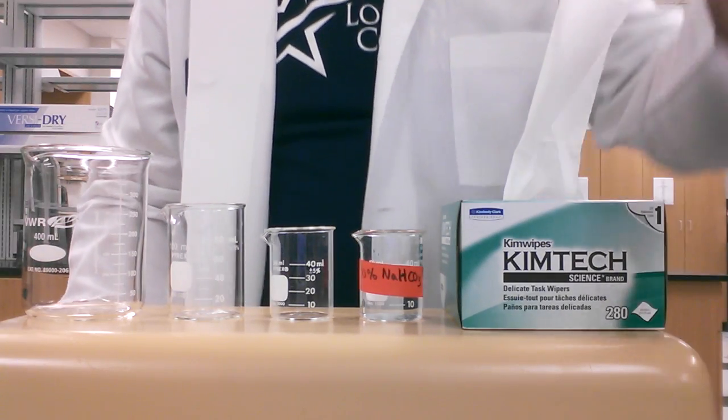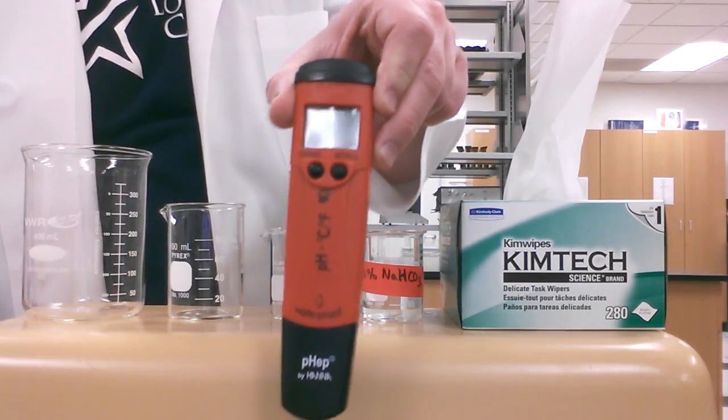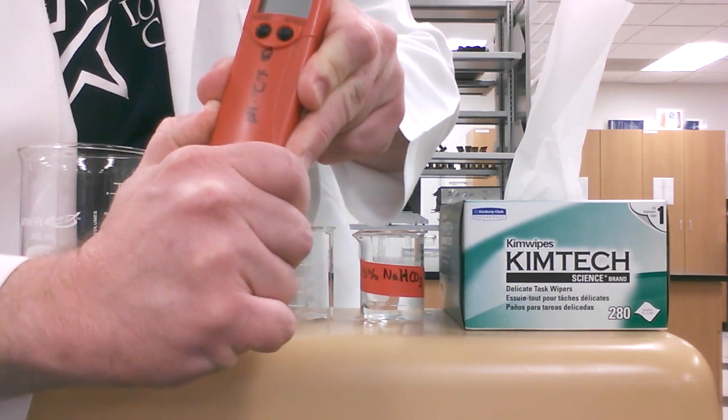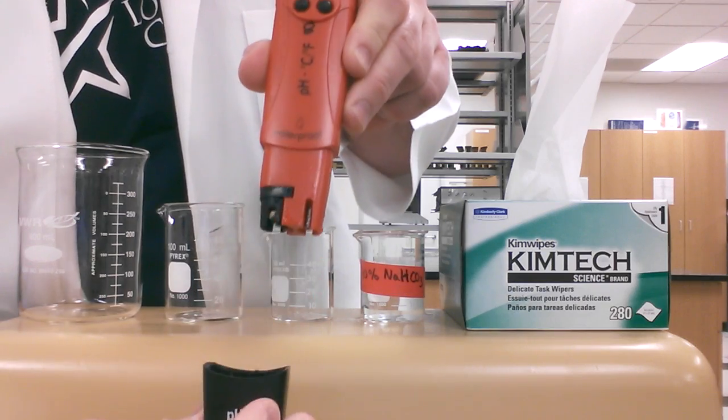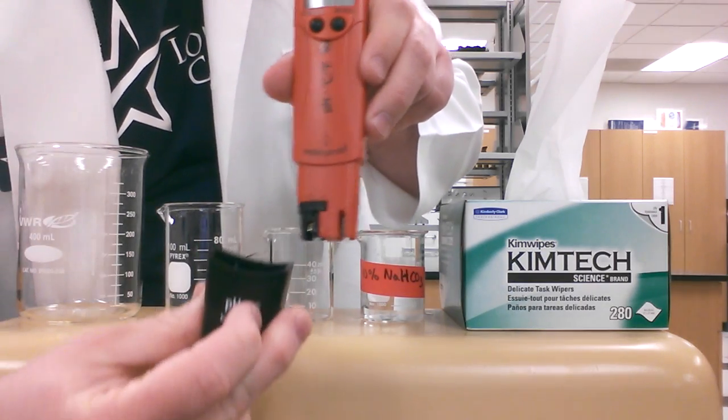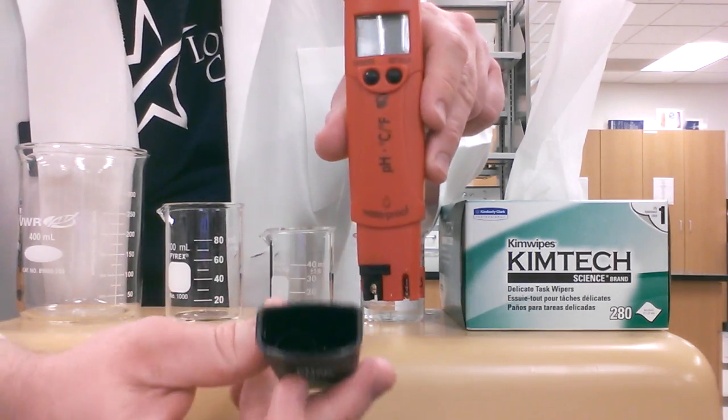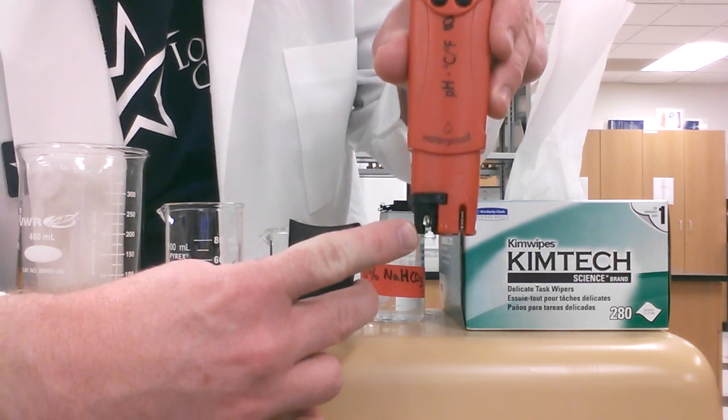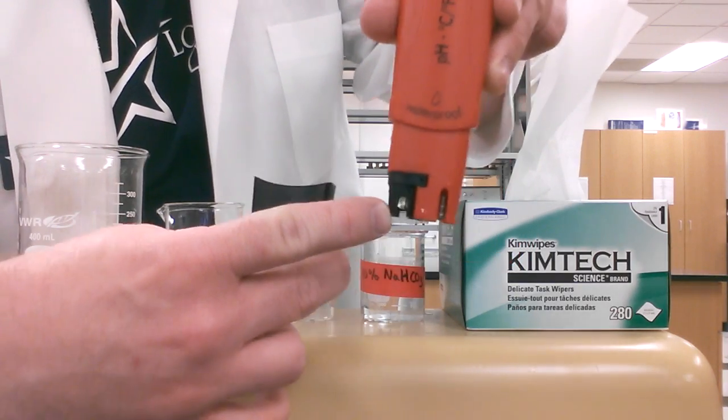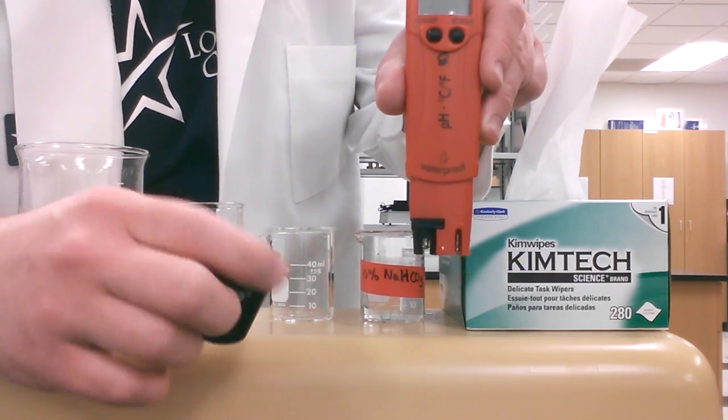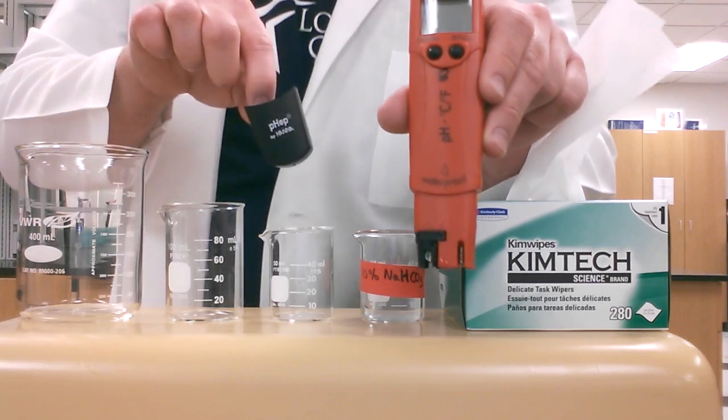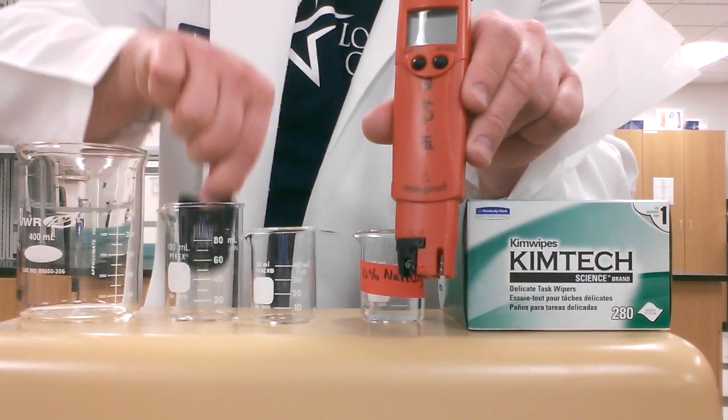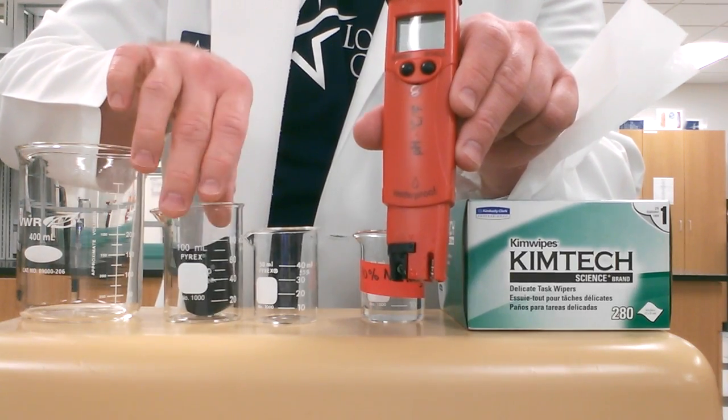The first thing we're going to do is remove the cap from the pH meter. This may take a little bit of strength. Pop this cap off and be careful because there is a little bit of solution in this cap, and that's what protects our pH electrode, this little glass bulb here, when we're not using it. I'm going to put this cap into the 50 ml beaker or the 100 ml beaker, and that's going to help me keep from losing this thing.